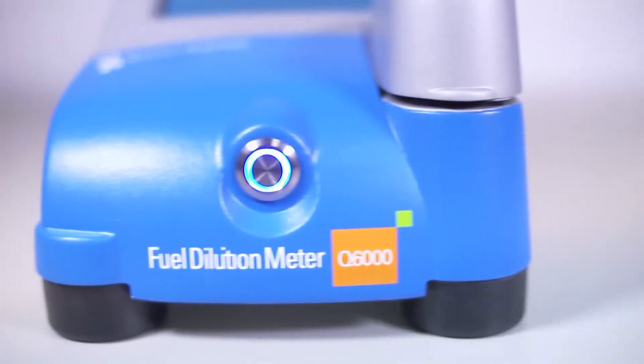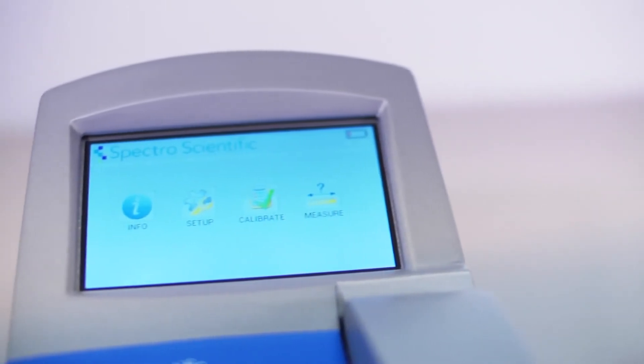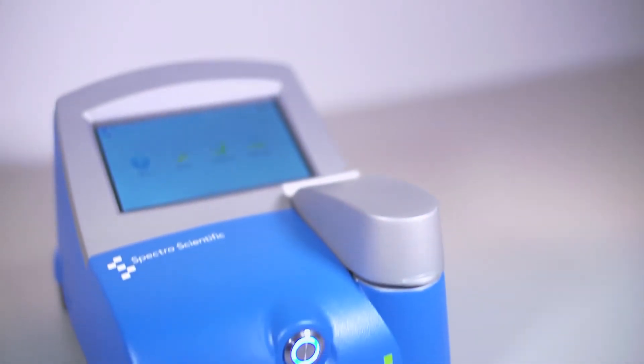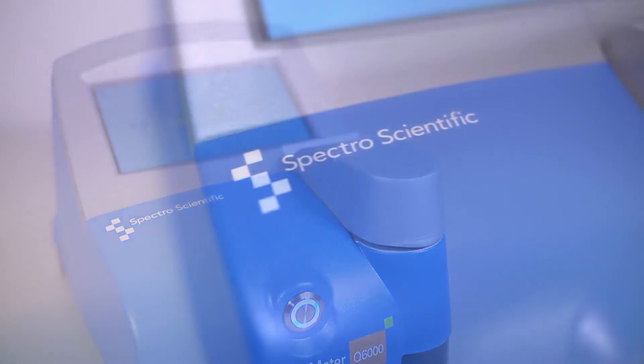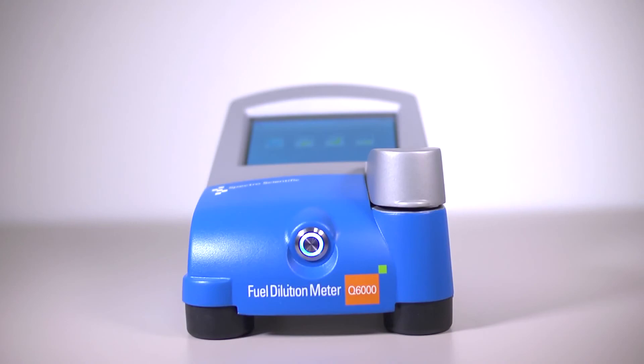The Q6000 minimizes the worry and errors that come with learning different methods and equipment. Its simple to use interface lets you maintain equipment at peak performance with less downtime and the results correlate to expensive GC methods.